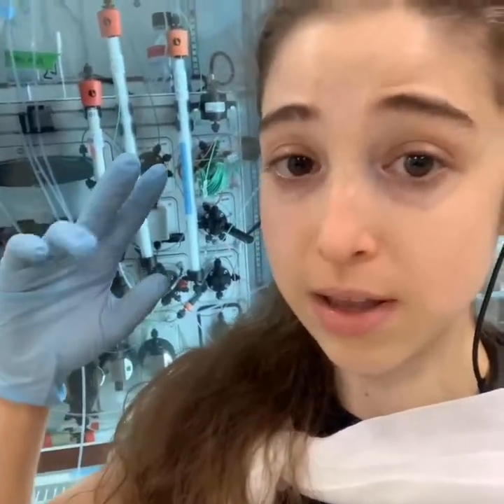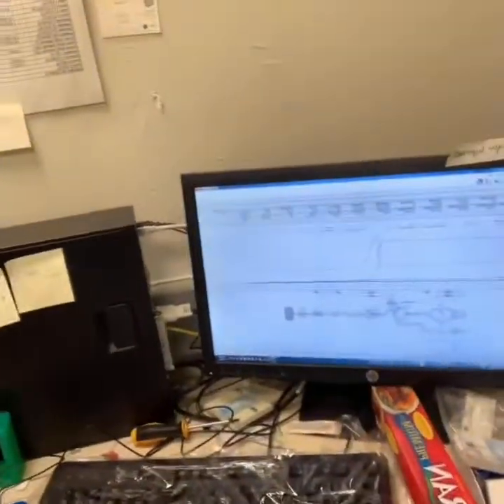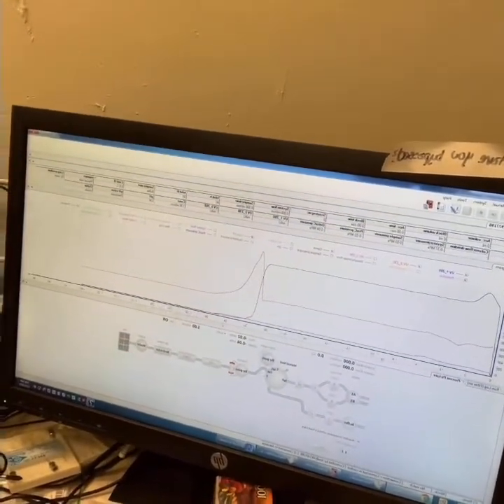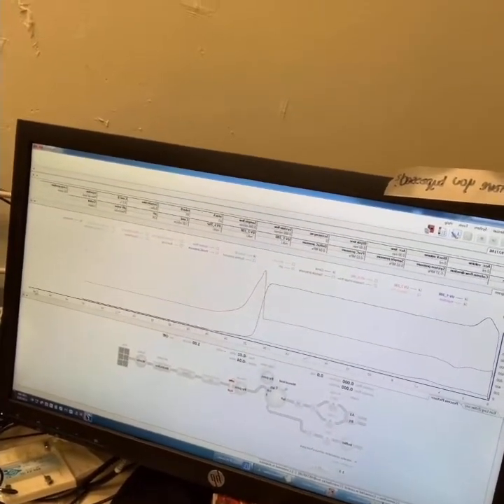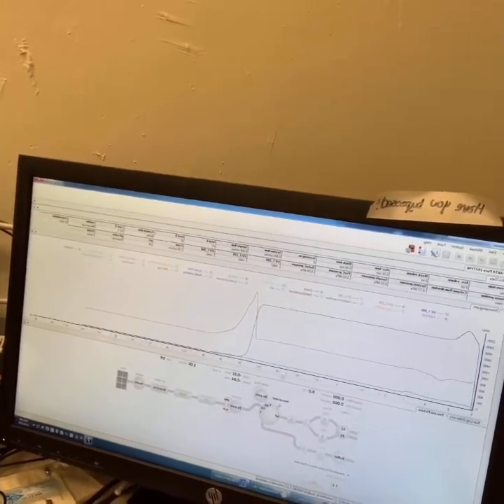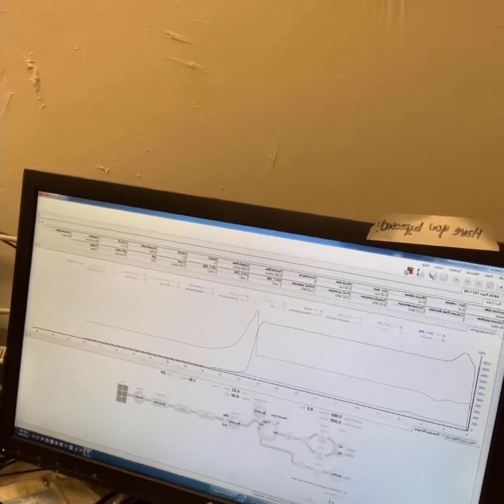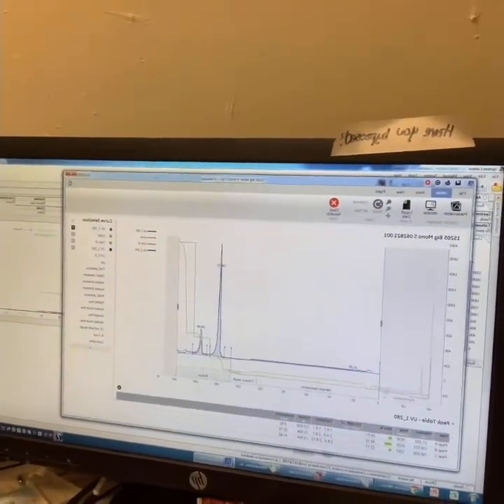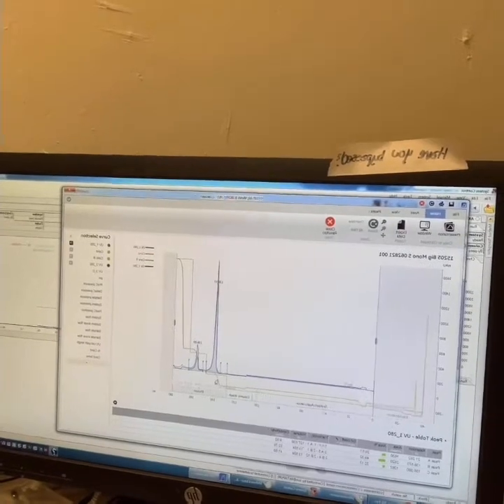And so then what happens is that you have this UV monitor that after the column, and it's going to come here and it's going to give you this readout. So this is showing you the elution. This is right now it's in milliliters, so this is how much is eluted from the column since you started. If you look at something like this, so you can see this run. I had my sample going through and this was an ion exchange.